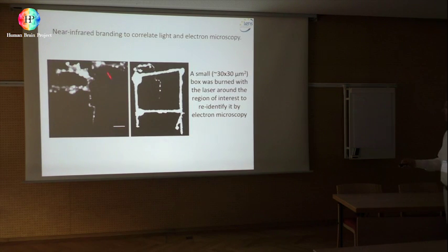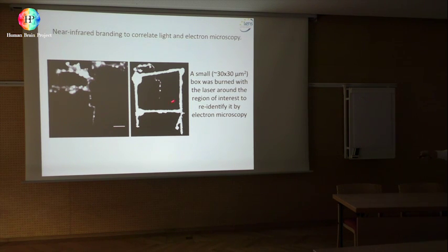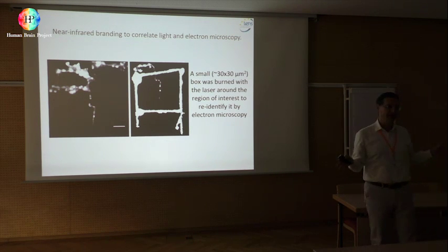After cutting, after having a marker like this, we remove the brain, we fix the brain, we cut the brain in different slices, we prepare the slices for electron microscopy imaging, and then with the electron microscopy we recognize this asymmetric figure, and then we zoom in and we find, with image pattern analysis algorithms, exactly the same branch, which is not so easy because it's like finding a needle in this building, of course.